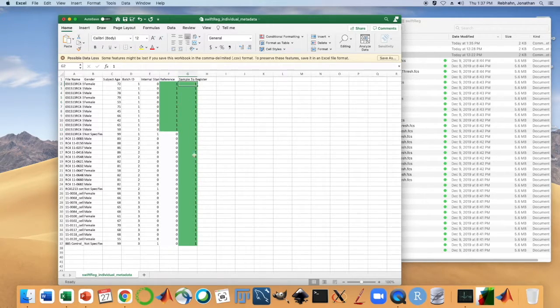And then we would apply the samples to register here by giving everything a 1, and so each individual sample would then be registered according to this reference that we've defined. And I'm not going to use this one, so I won't save it.